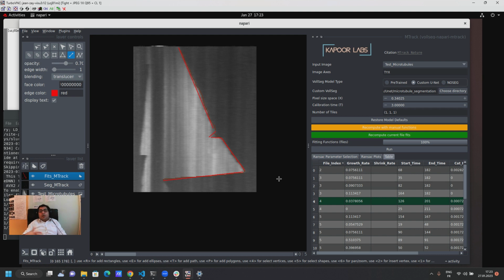Now it's out for testing. So now I'm expecting people to give me feedback on how they feel about the UX design, about the performance, and I'll make some test cases to handle the programming side of it and the algorithmic side of it. But for now, you can get it from the Napari Hub, and try out this version. I think it's 1.3.3, which is the latest one on the hub. So try it out on your microtubules and then give me feedback.